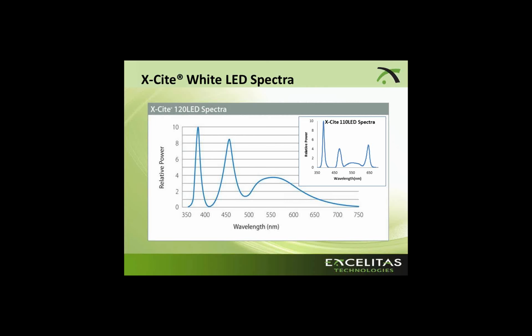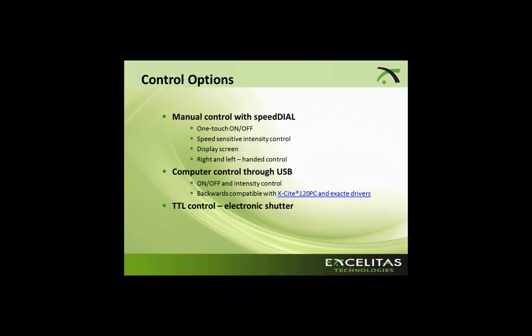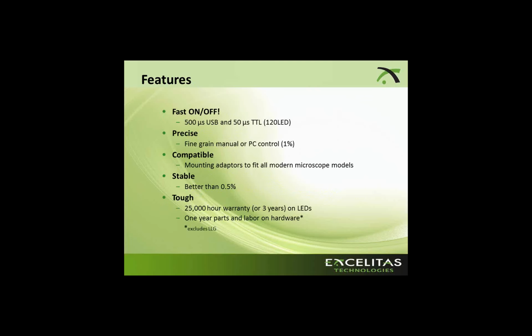So all of the microscope company software will control most of these light sources. And to give you an idea of how quickly they switch on and off, you're looking at 500 microseconds USB and 50 microseconds TTL, which is more than what most people want.